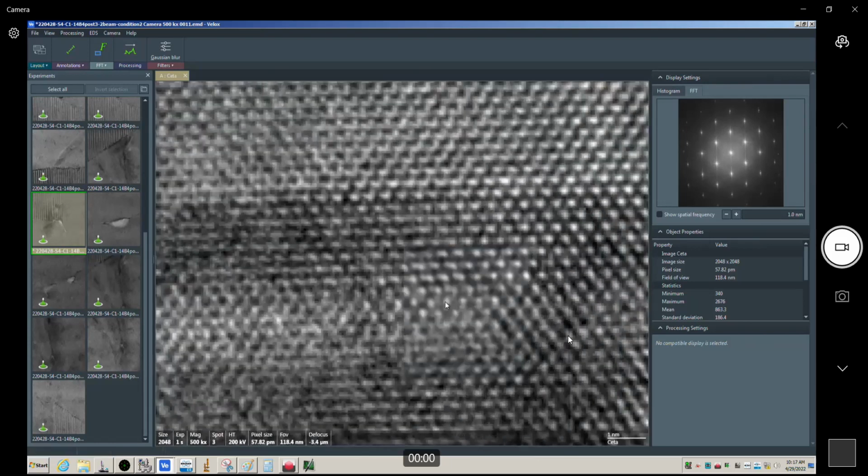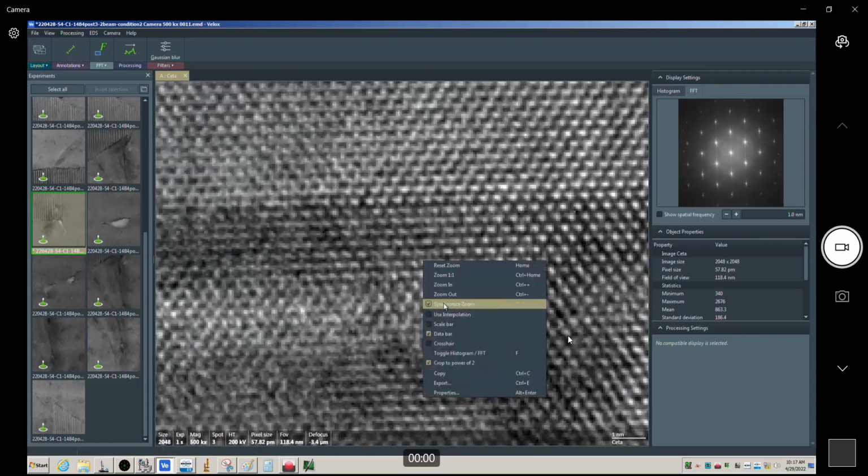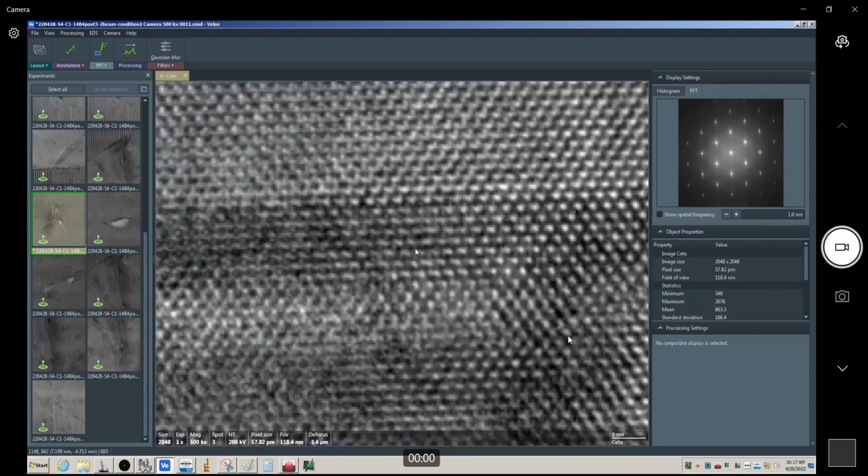Okay, there we go. Was it mag sensitive? Yeah, I think if you mag in too far, you don't see it. So right about here, if you look at it now, it kind of smooths it out a little bit. Anyways, that's called interpolation. It's basically a smoothing effect that it has on the images when you get them.